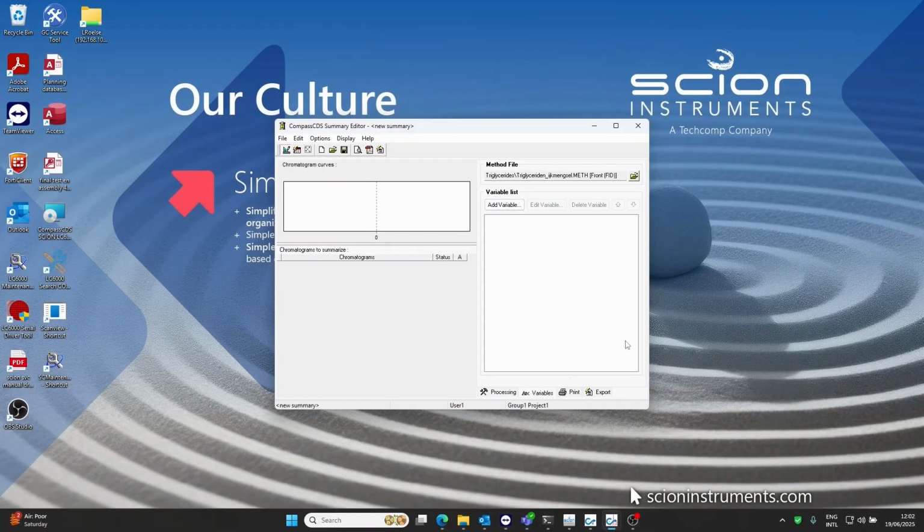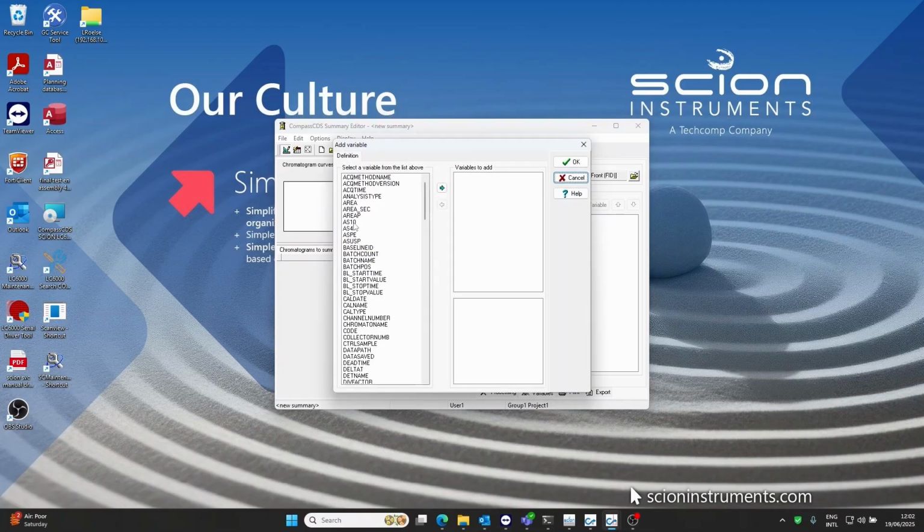And then here below you can add variables. So click on add variable. And for this example, I'm going to use the variable area second. And here you can see that I have 4 integrated peaks, which are all selected. And now I just click on OK.